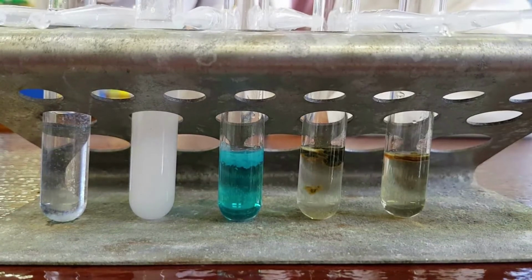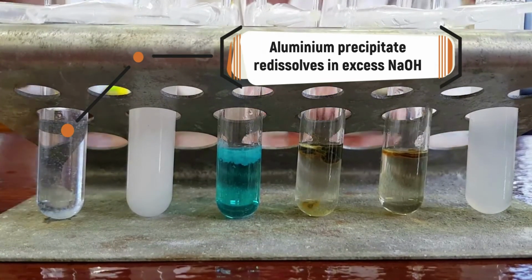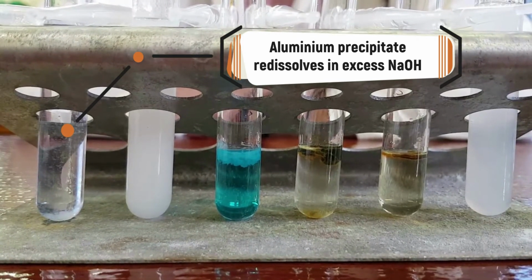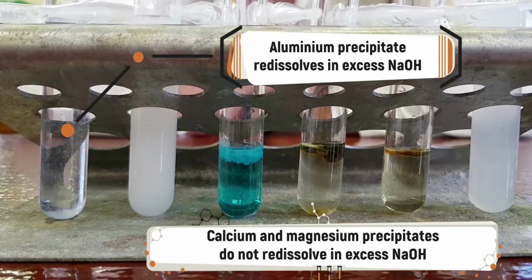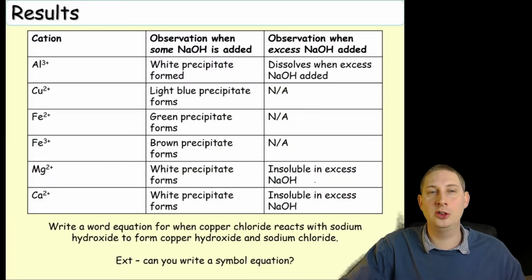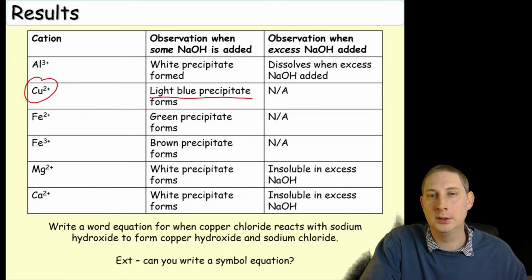And Mr. Reeves is going to give that a quick shake. Excellent. So there, the aluminium sulfate initially formed a white precipitate with a small amount of sodium hydroxide, about 5 drops, but that precipitate redissolved in excess sodium hydroxide, while the calcium and magnesium solutions did not redissolve in excess hydroxide. So as you saw there, the copper solution formed a light blue precipitate, and that was easily identifiable. We didn't need to do the second test.